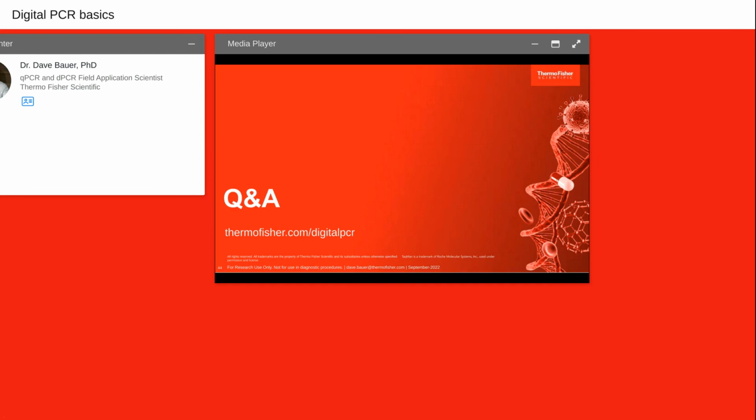One is that the instrument actually takes 2 images. So there's the endpoint detection image that we've been talking about, but there's actually another image collection step really early on in PCR cycling to get the background fluorescence levels from that particular sample on that particular plate. And this is collected for every single individual experiment and then subtracted out from the endpoint image. So that means if there was any fluorescent artifact present, it would get subtracted away, meaning it would not contribute to a false positive because it would get subtracted out.